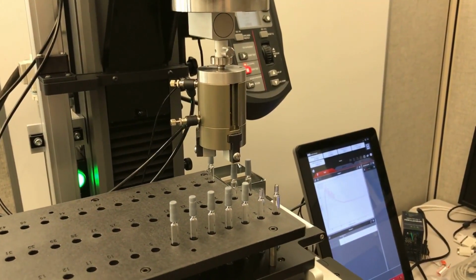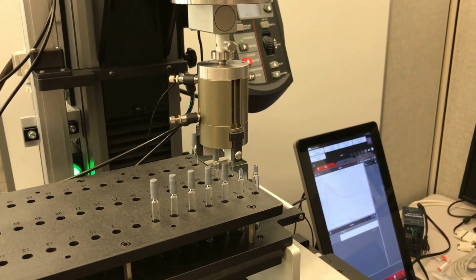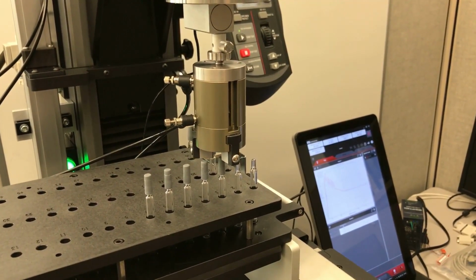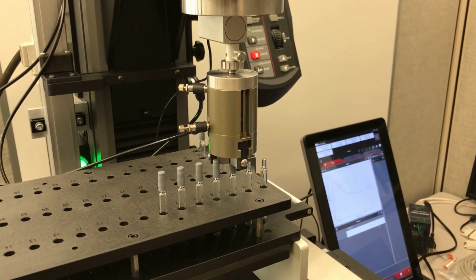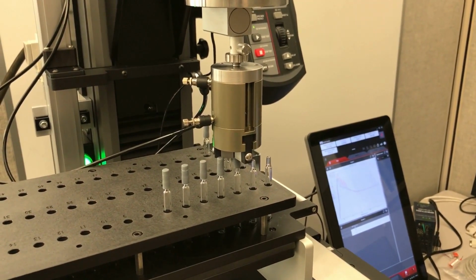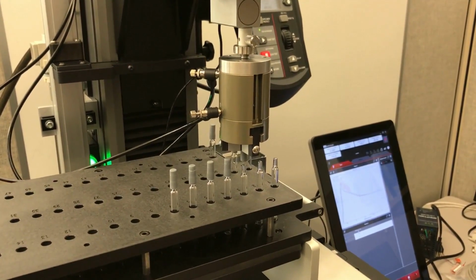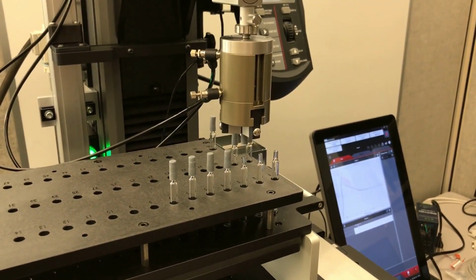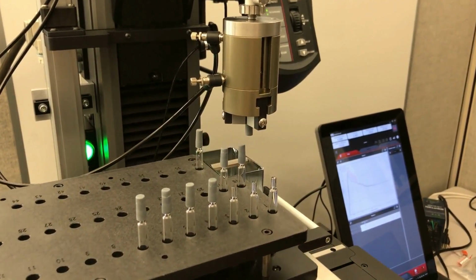The system seen here is performing a cap removal force test on syringes. The XY stage moves the specimen to be tested into position under the crosshead. The crosshead moves down and the pneumatic grip closes onto the cap before performing the test. After the test, the cap is dropped into a collection box on the side of the stage.